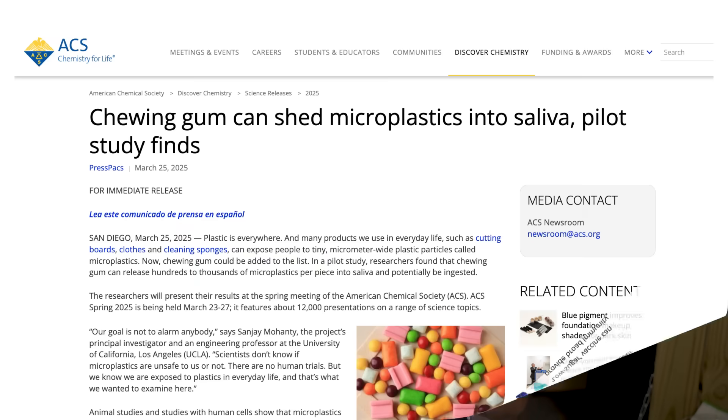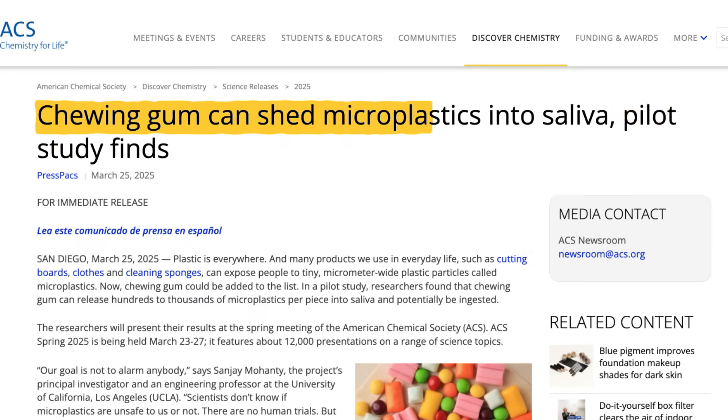A few months ago, I read a press release announcing that researchers had discovered microplastics in chewing gum. This was just a press release — the paper had not been published yet — but my first thought was, I gotta immediately test this myself.